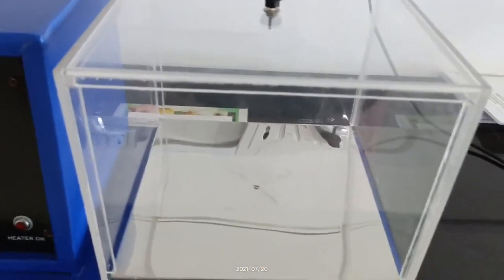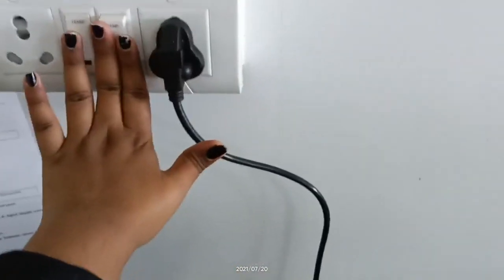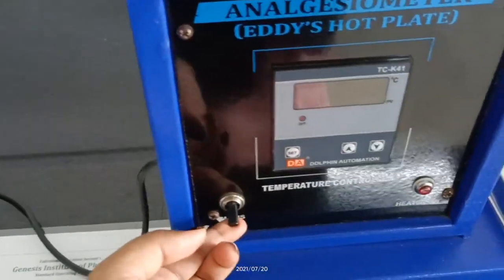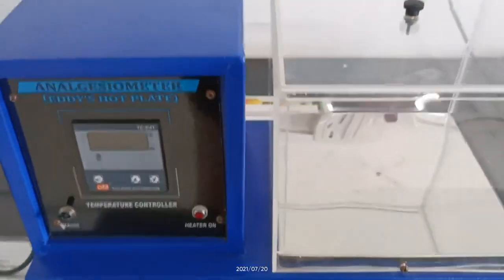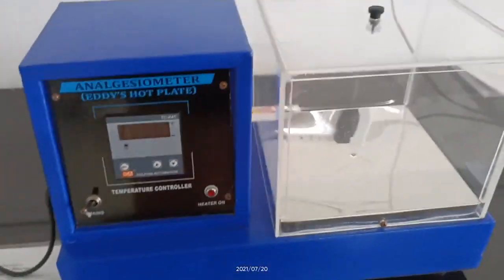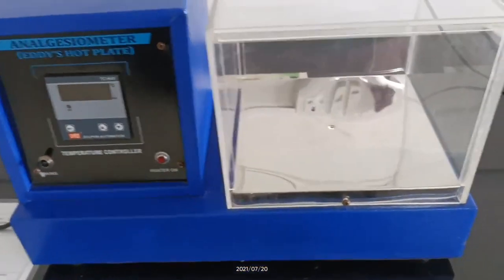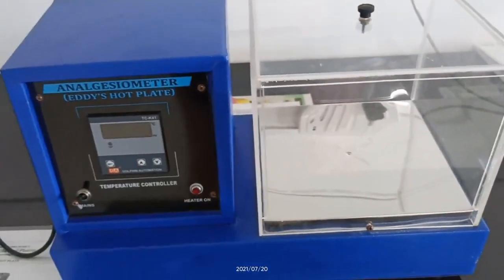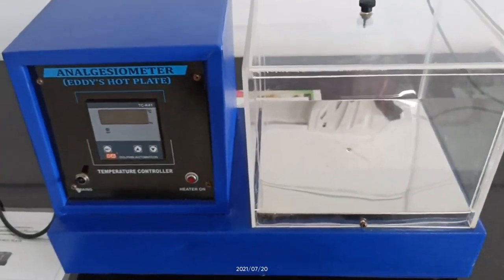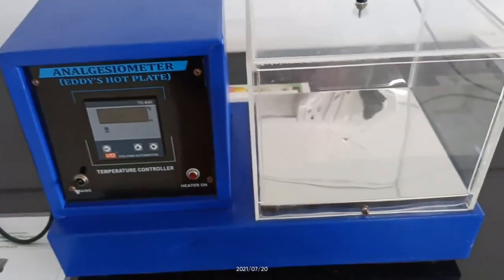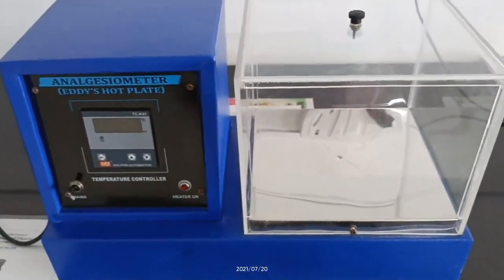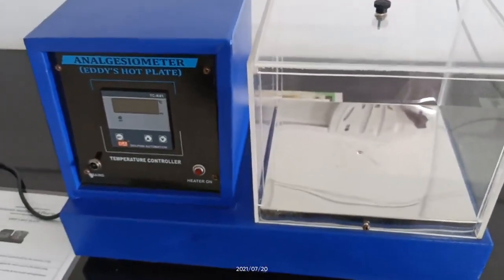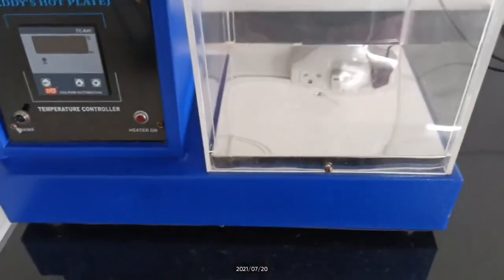After completion of the experiment, we switch off the instrument and clean it again with a dry, clean cloth. If you go for higher education in M.Pharm in pharmacology, you will be able to perform this experiment using the ED's hot plate analgesiometer.